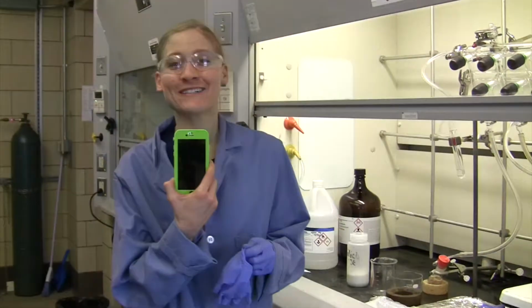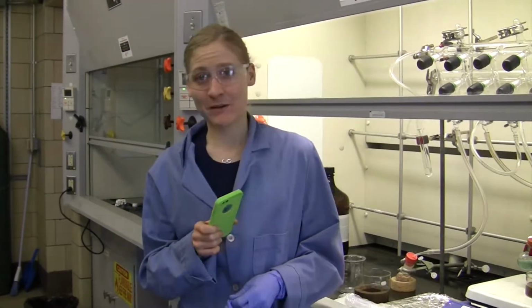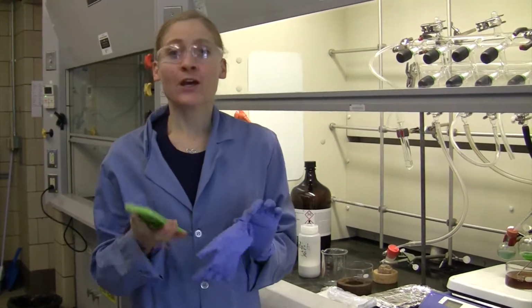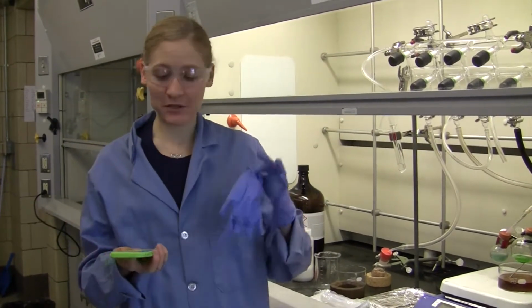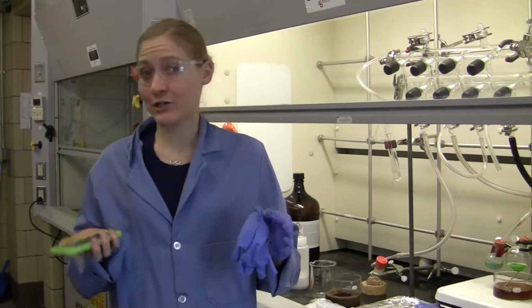This is my cell phone. It is a timer that's reminding me that the sparging that we talked about last time is done. I took off my glove. You never want to touch your cell phone with your gloves on. This is something you put near your face. You don't want the chemicals that are on your gloves on your face, on your ear, in your hair, on your clothing.